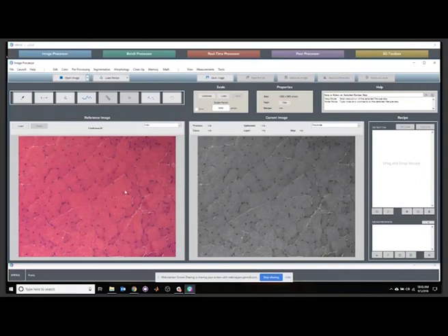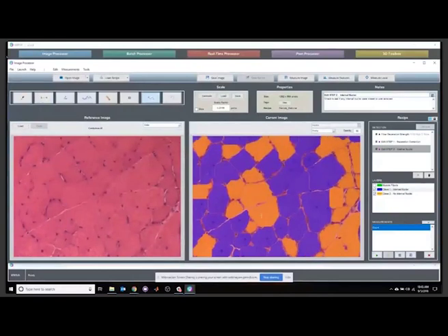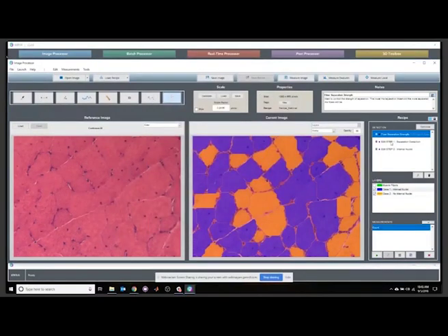What I want to demonstrate today is a semi-automated solution where the software is capable of getting 90% of these fibers for you, and what you have to do is simply make some minor edits to some of these key steps, and it's able to regenerate the entirety of the recipe for you.